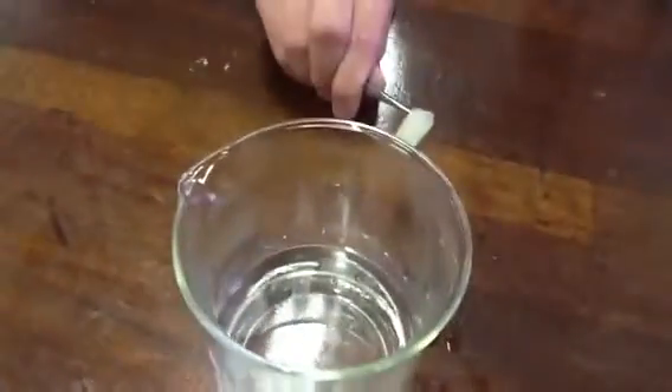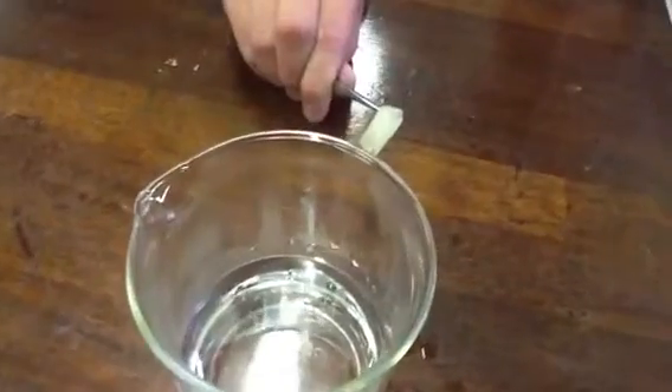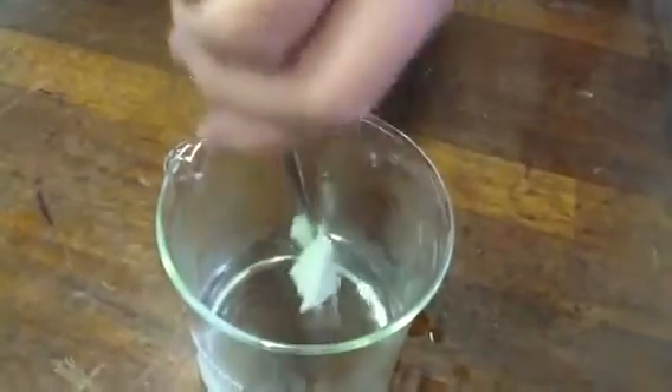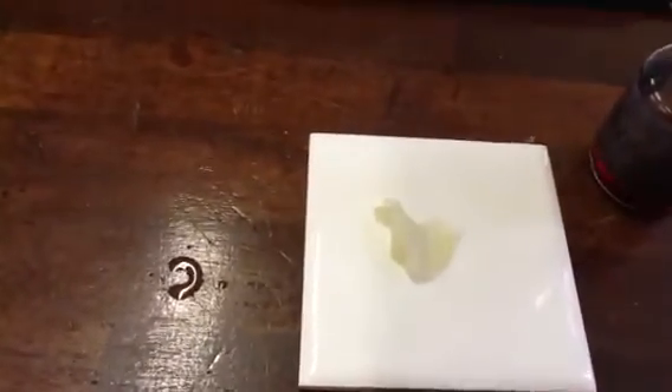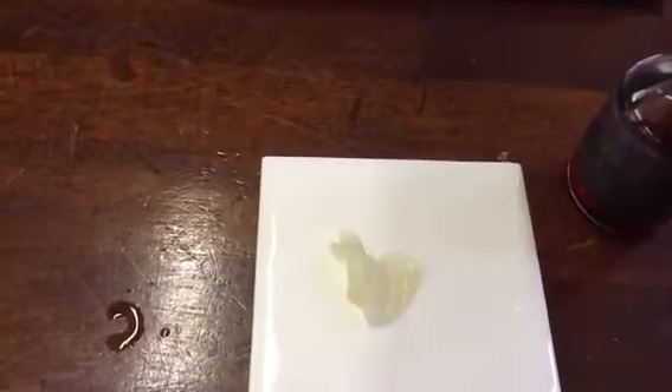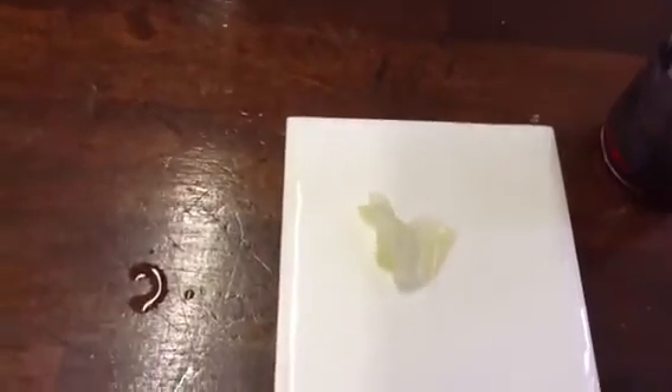Now, how should the leaf feel now, Carl? Brittle. So what do we have to do to soften it? Dip it into the boiling water, Richard, please, just to soften it. Now you can place it onto the white tile. What colour is our leaf now, Laura? Cream. Excellent. So what's been removed from it? The chlorophyll. So we put it in boiling water initially to stop any chemical reactions, then into alcohol to remove the chlorophyll, then dipped it into hot water to soften the leaf because it had turned brittle. Now we can see it's completely cream.